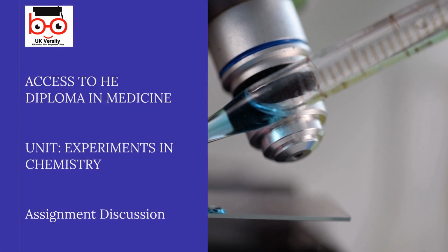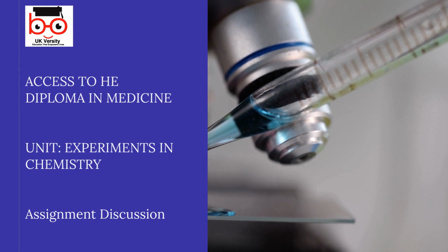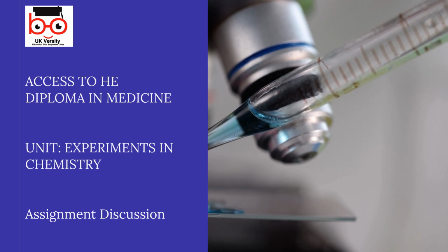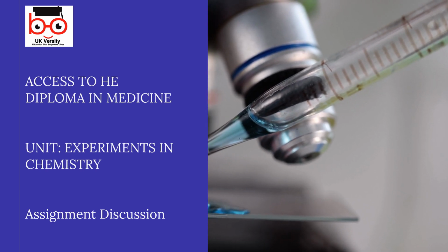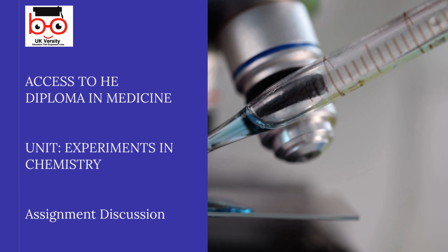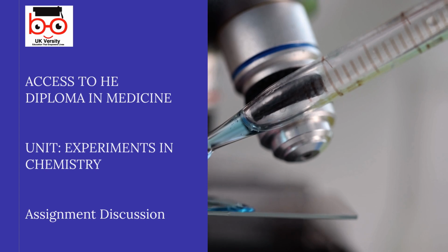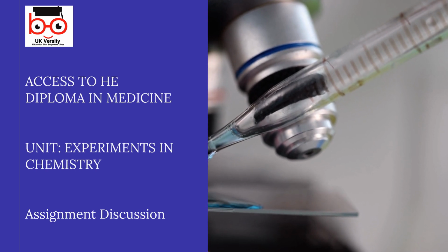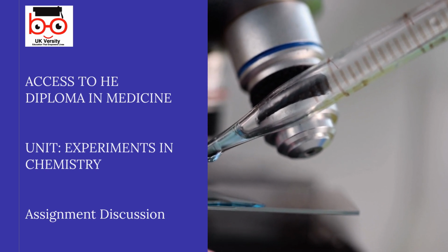This session focuses on assignment discussion for the unit Experiments in Chemistry. In this video, we will explore two key experiments: the effect of dilution on hydrochloric acid and the determination of enthalpy change using Hess's law. You will also discover how these experiments are connected to applications in the field of medicine.